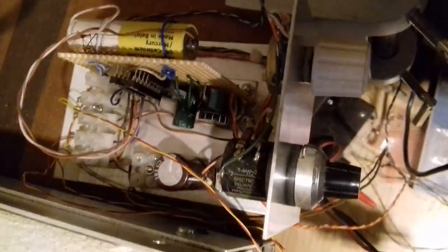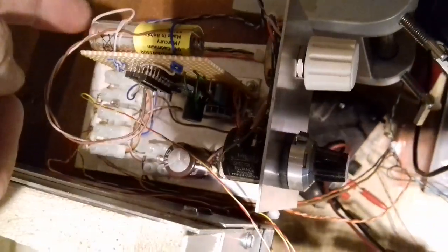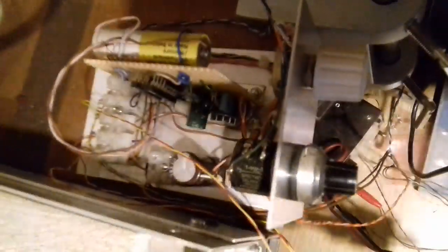That is then run to this differential amplifier, where I reference it to a stable DC source - in this case, just a battery. That's not a very elegant solution, but it does work, at least right now.